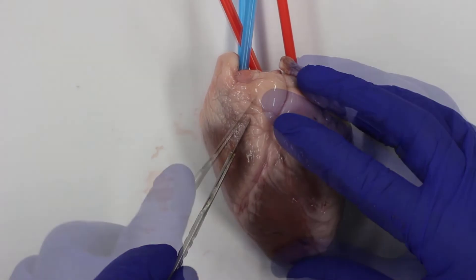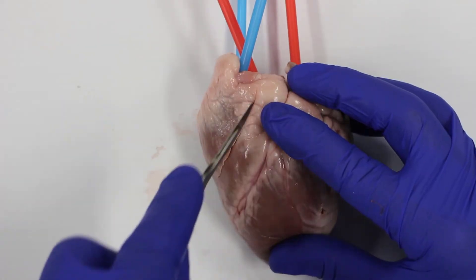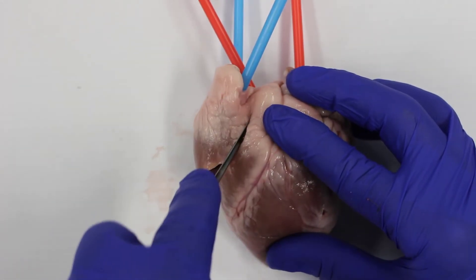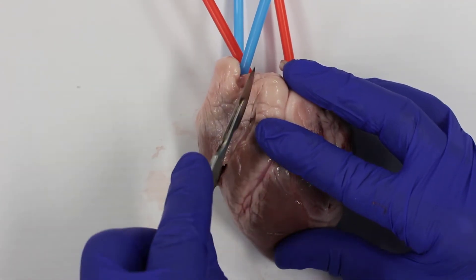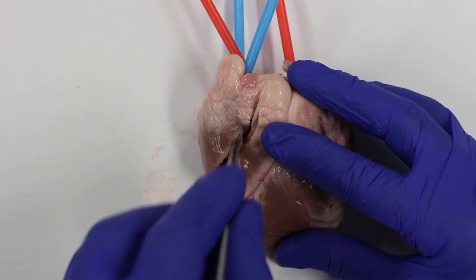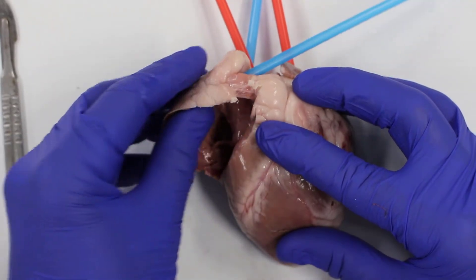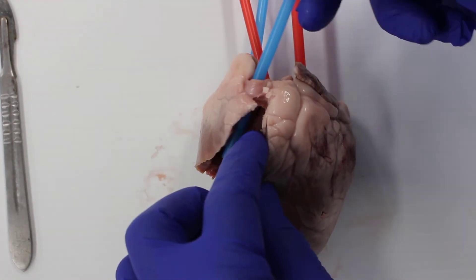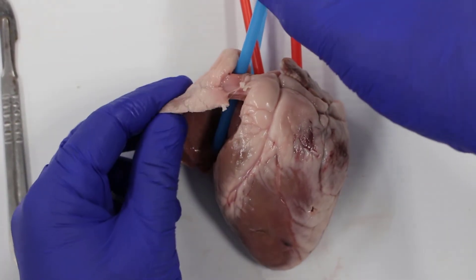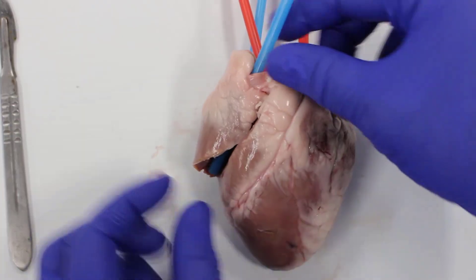Now we're going to open up the heart. See this line — the coronary artery — we're going to cut on this side of it and open up the right hand side of the heart first, using small incisions. This white stuff here is fat. Human hearts have fat too. We want to cut away from the body.